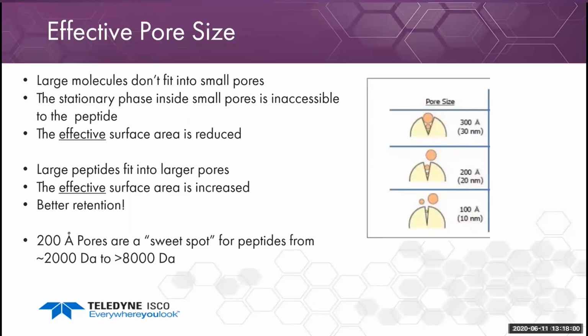To a limit, larger pores retain larger peptides better. My experience is the changeover from small molecule to large is on the order of about 2,000 Daltons in this context. However, note that you will hear different numbers from different people based on their tests. We all agree, however, about the concept of effective surface area.